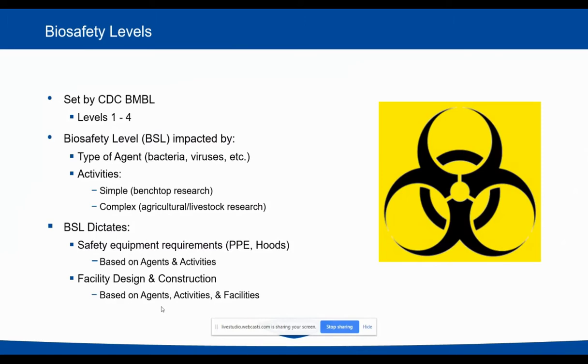These do vary depending on where you might be. So if you're sitting in Canada, certainly you know that there are different guidelines, free and available as well. And depending on your country, you may find the same is true, where if the CDC doesn't apply, there might be another leading document. So a good starting point, and certainly a reference for this presentation, is the CDC BMBL.